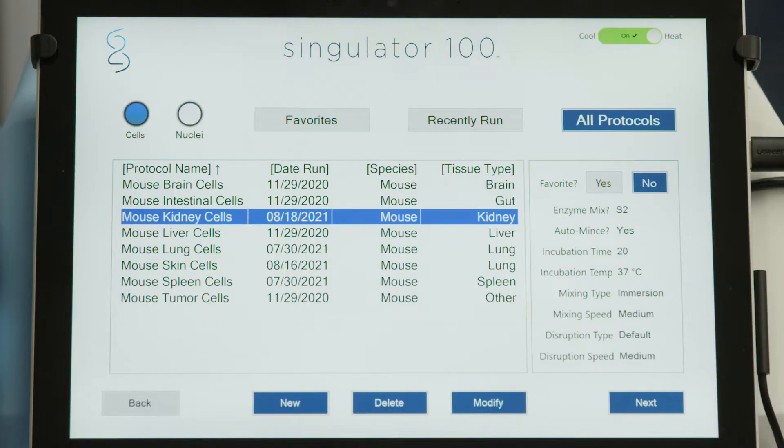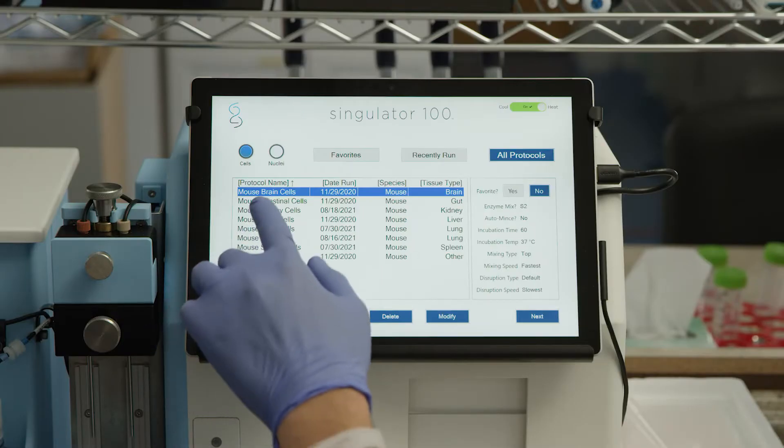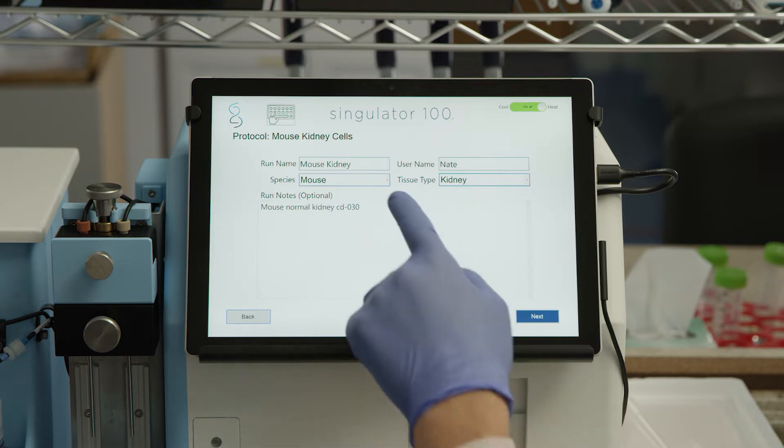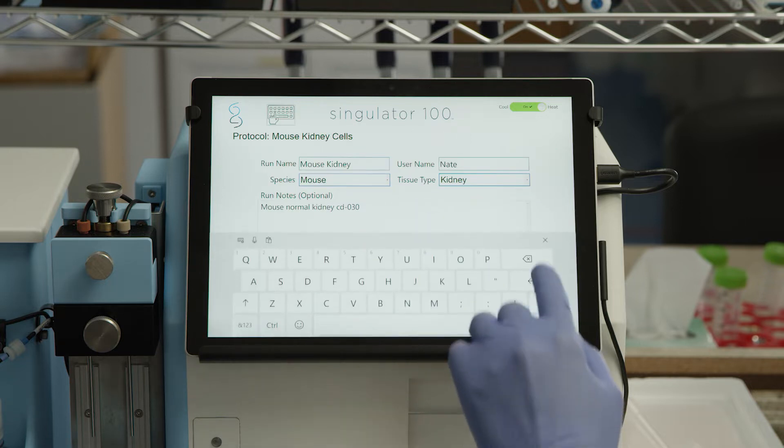Select the All Protocols tab to view all available protocols, or select from Favorites or Recently Run. Select the desired protocol and then select Next to proceed with the Run, or Modify to make changes to the default Run parameters.